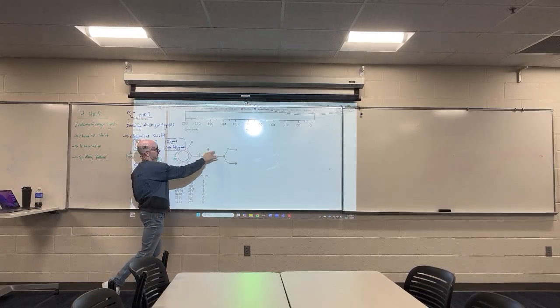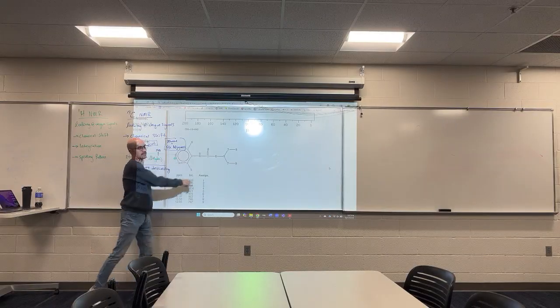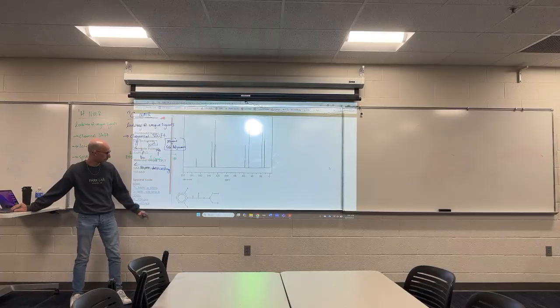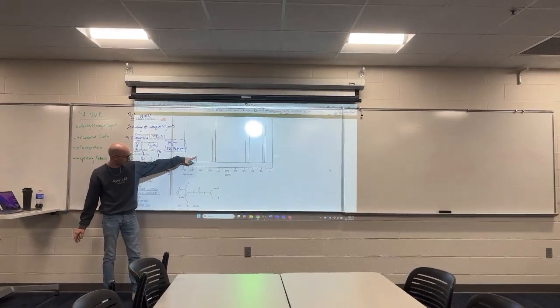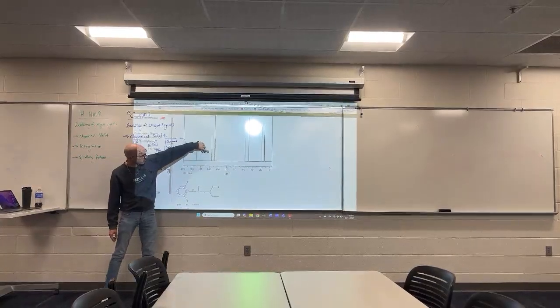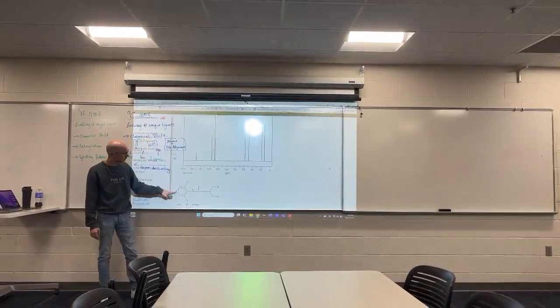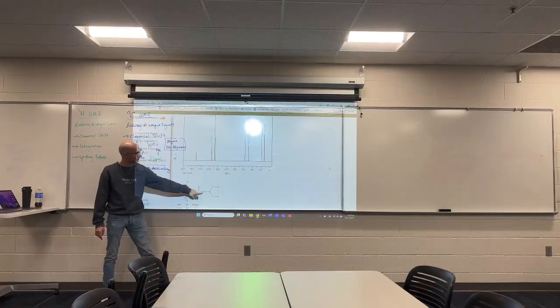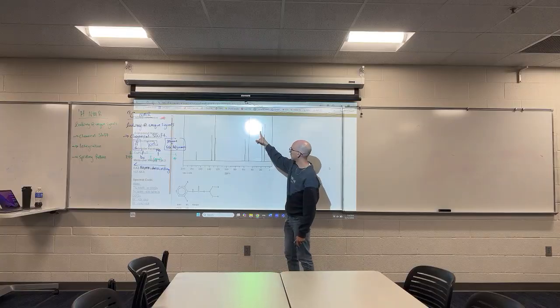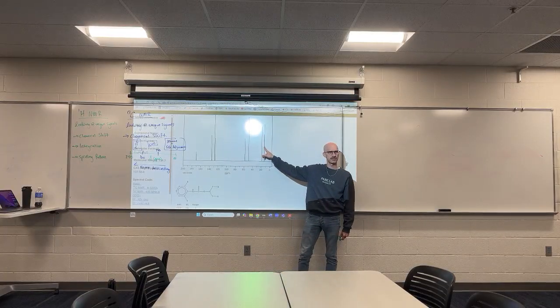So because of that symmetry, again, these are the same as each other. They actually have gone through to map them. This is signal number 1, looking from the left. Signal number 1, signal number 2, signal number 3, signal number 4, signal number 5, 6, 7, 8. Did I run off? 9. Did I get 12? Mm-hmm.